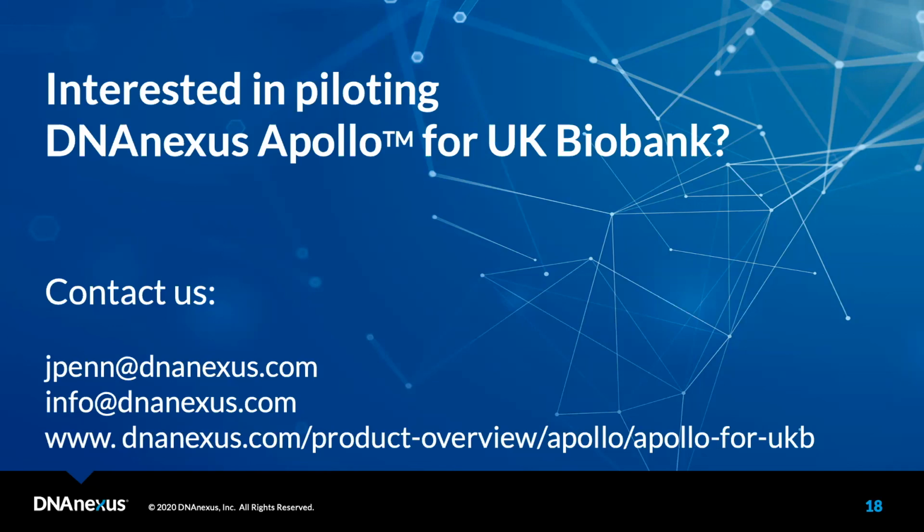As many times as you turn that crank is how many times those analyses launch off. You could launch in parallel as many analyses as you're interested in running, with the breadth of the cloud being the only potential limiting factor. And as far as we're concerned, that's nearly infinite, essentially. Great, thank you.